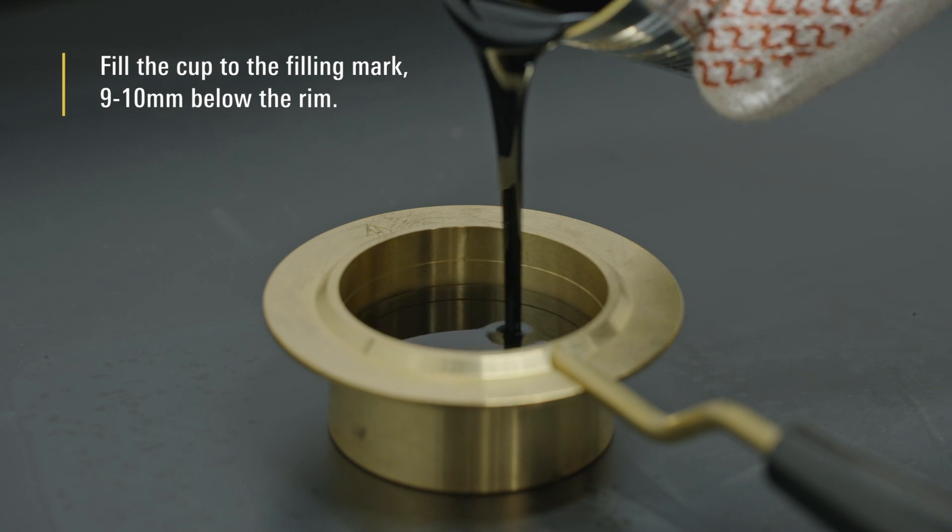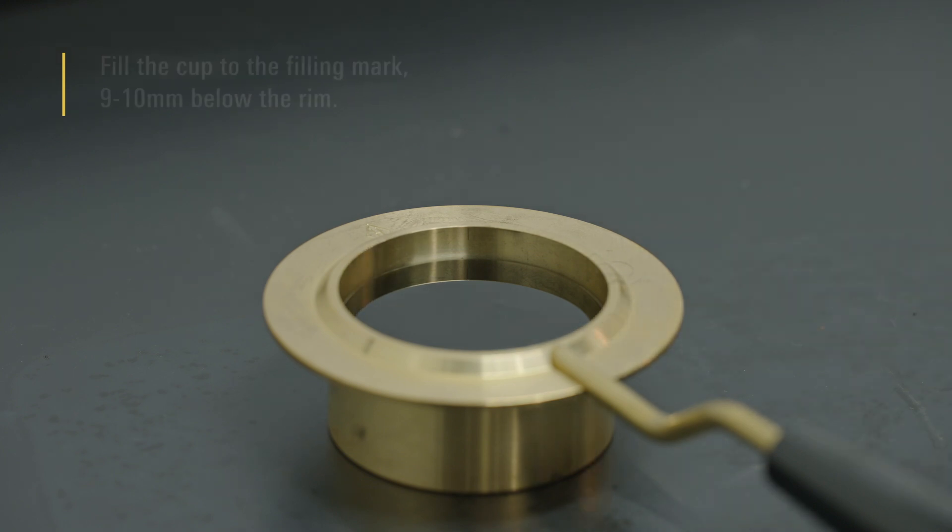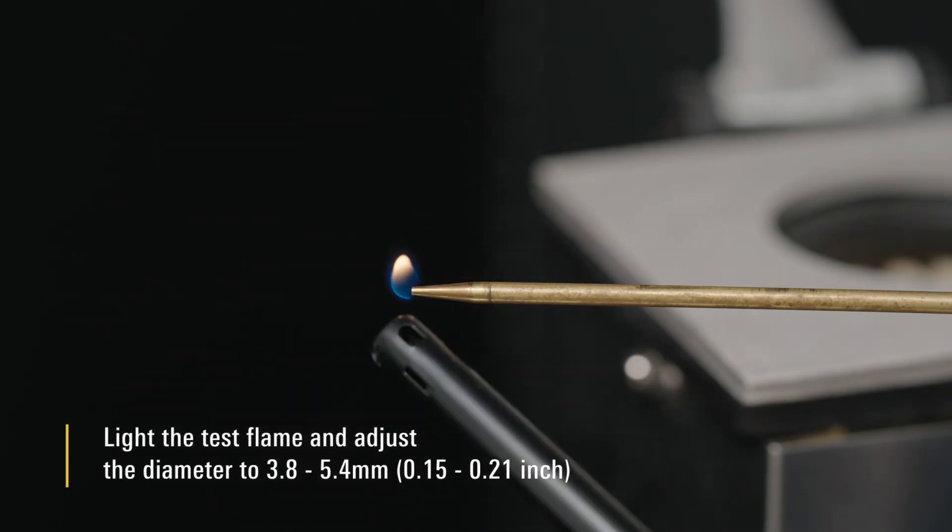The cup can be filled away from the tester if the temperature measuring device depth has been set before the test. Light the test flame and adjust the diameter to 3.8 to 5.4 mm.